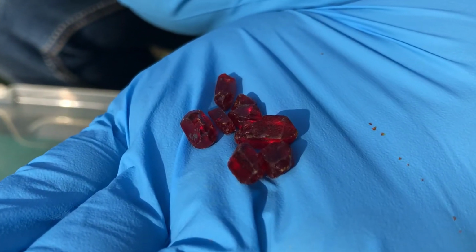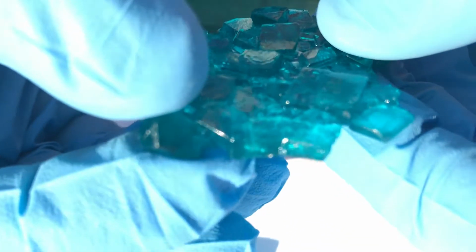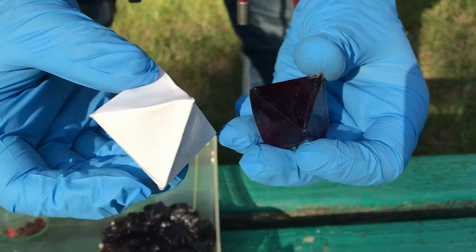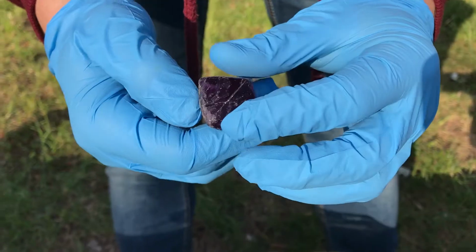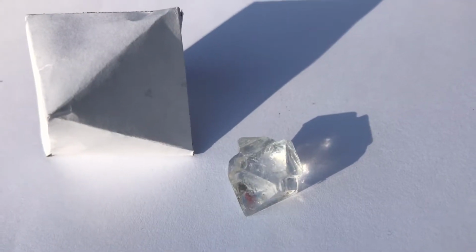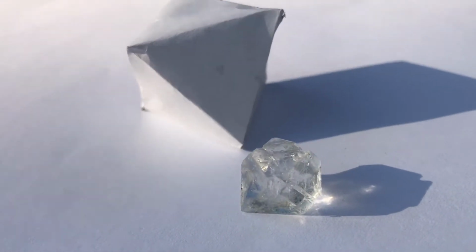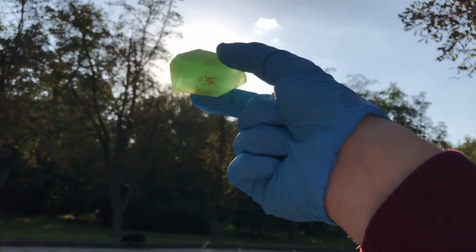Crystallohydrates are made by pouring hot water into the vessel and adding salt until it is no longer dissolvable. In this case, we get a saturated solution. Different salts have their own solubility curves. A solubility curve is a measure of how many grams of the salt can be dissolved in 100 milliliters of water at a certain temperature. Also, for all the salts, the information is different.